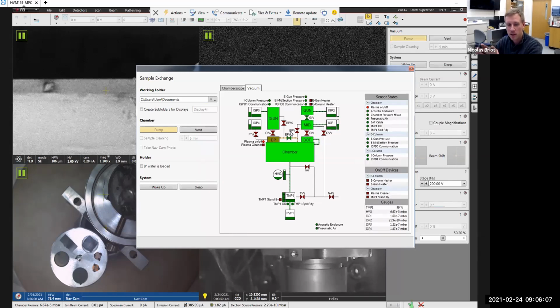Because we are using electrons to create an image, we have to have the whole system under vacuum. If you had this in air, the electrons would just scatter on all the air molecules and you would not be able to control the signal. Plus, it would arc, right? You would not be able to work like that. So every electron microscope has to be under a very good vacuum, okay?